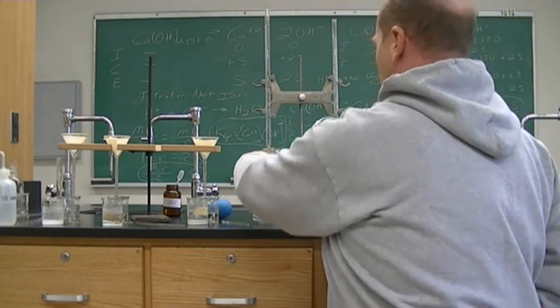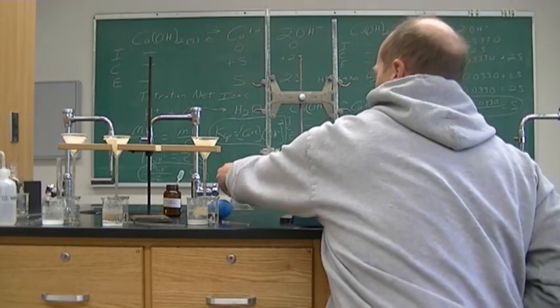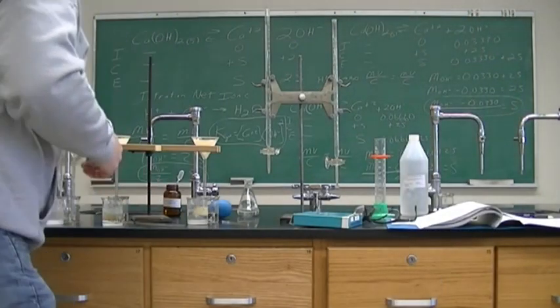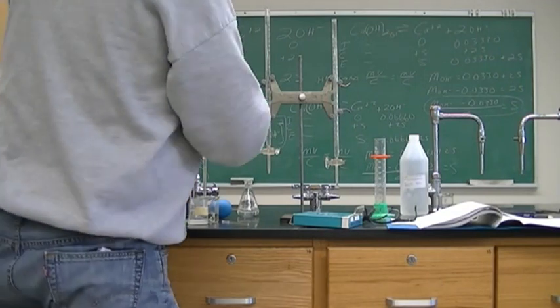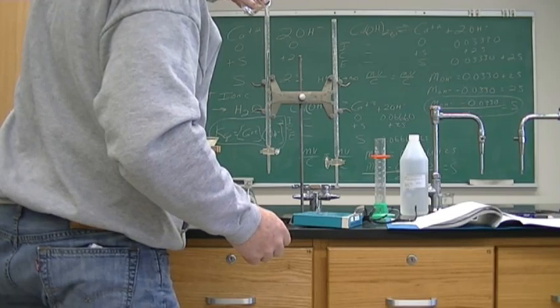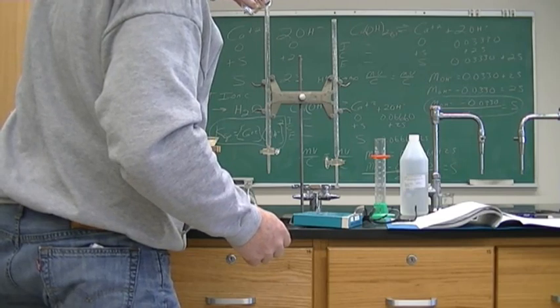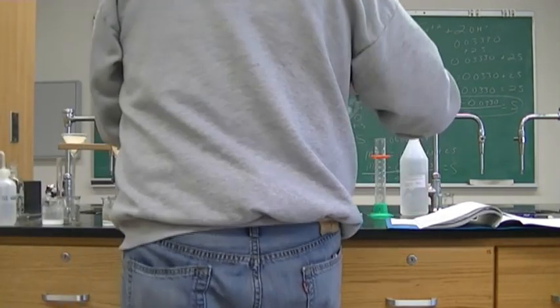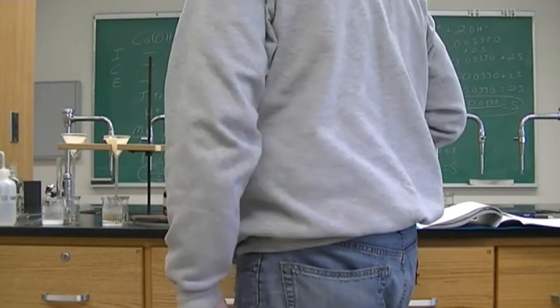All right. Let's add our HCl, fill this back up. And safety glasses back on.